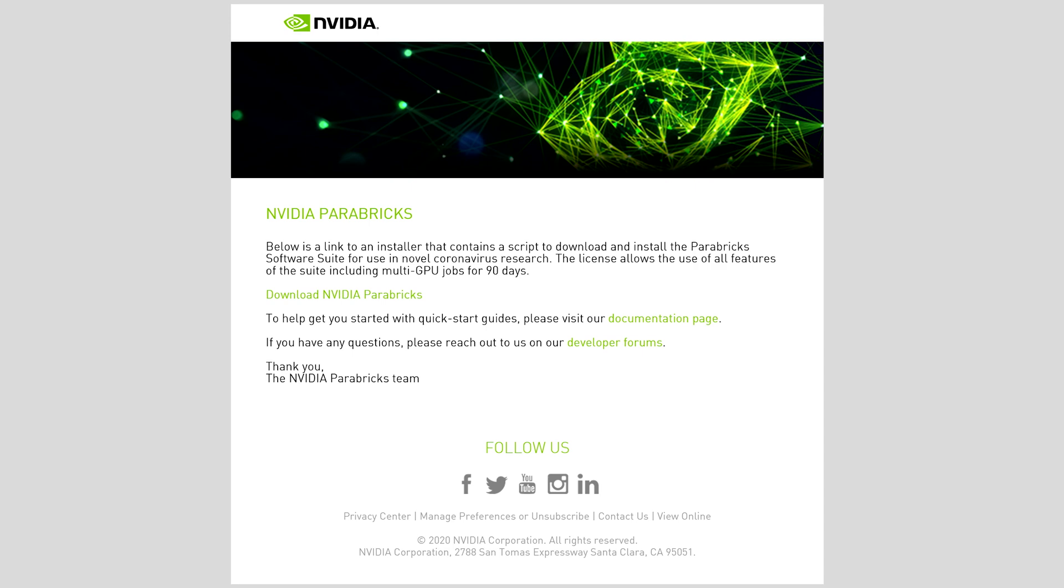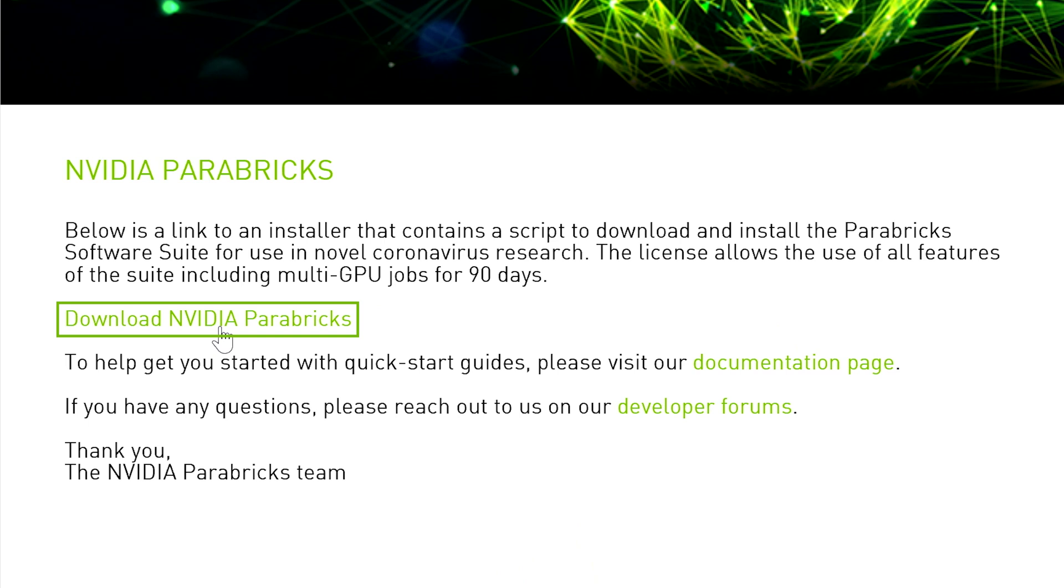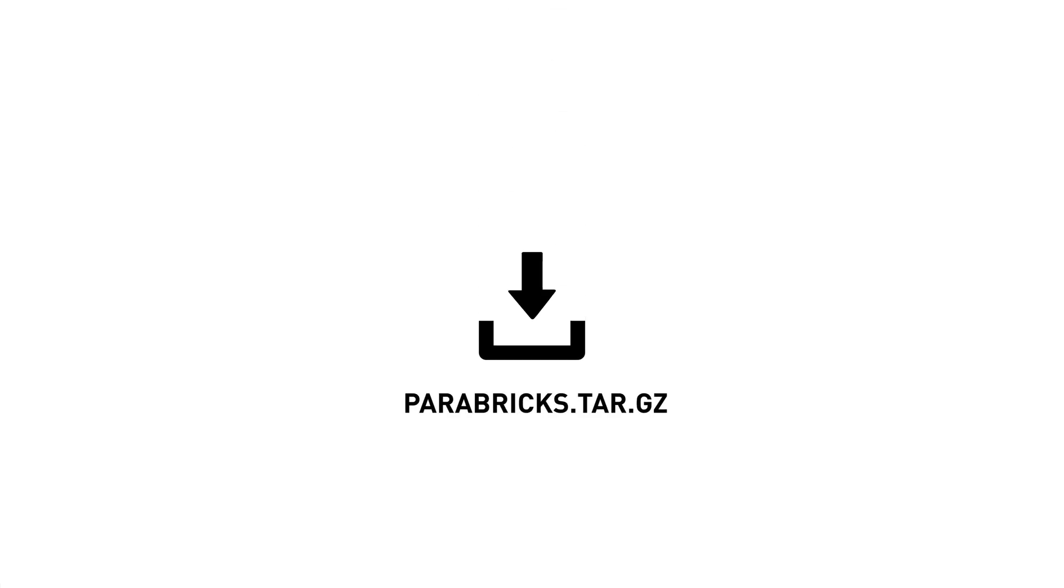Now, we will walk you through how to download and run the Parabricks installer. Click on the Download NVIDIA Parabricks link in the email you received. This will download Parabricks software package to your computer.